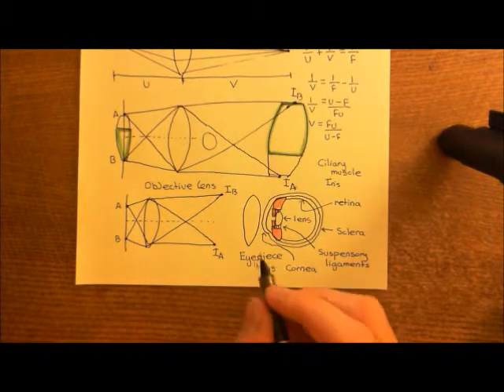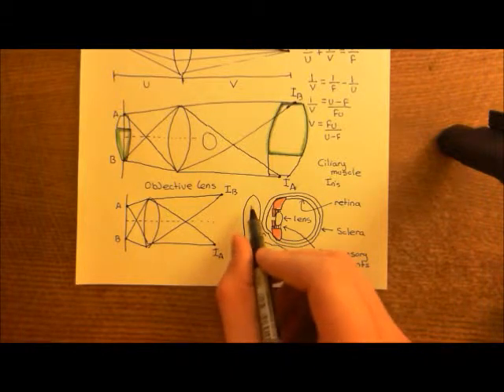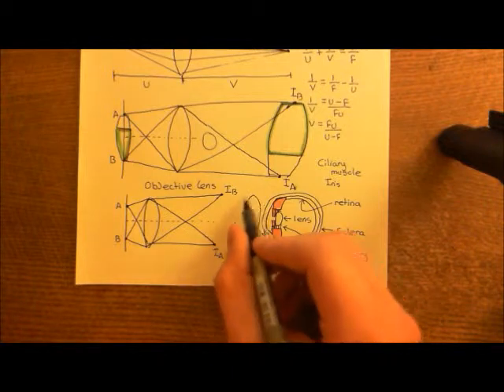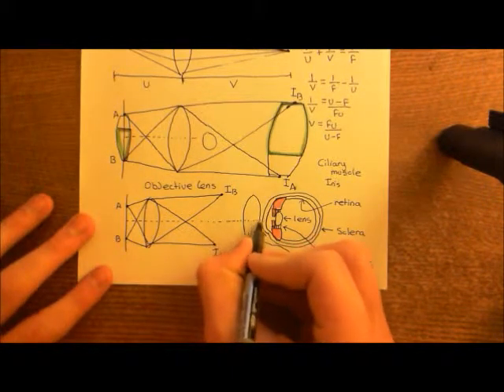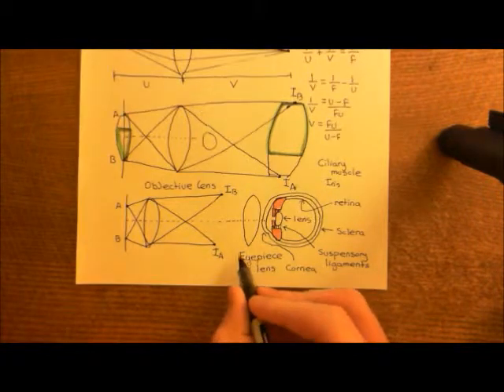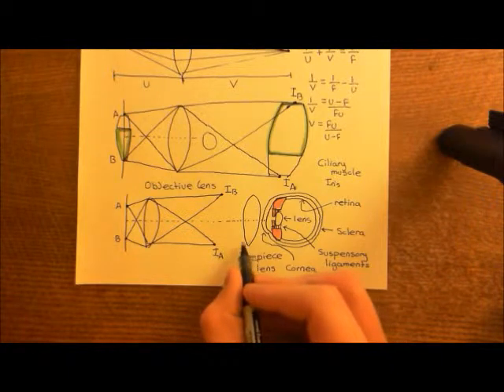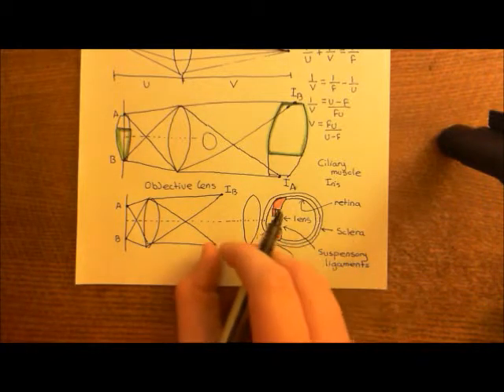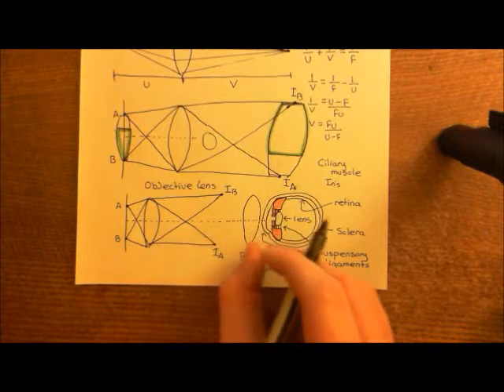Okay, now what's going to happen is that the light is now going to come through this microscope here, basically. Sorry, through this lens here. So let me just continue this dotted line here. Now, basically, this is the eyepiece lens, and what you can do is change the position of this eyepiece lens on the microscope. So you can move it forwards and backwards.